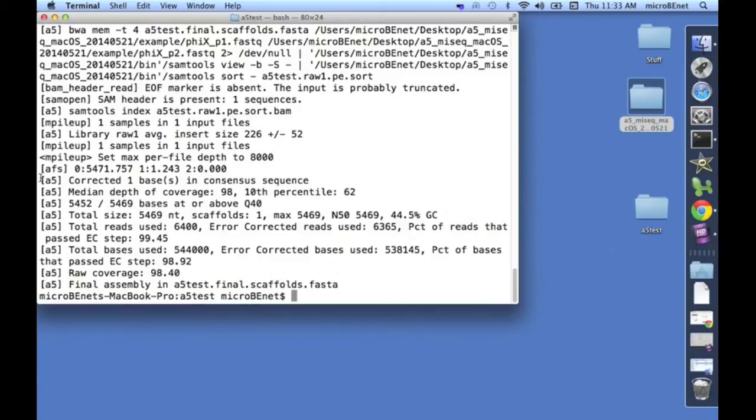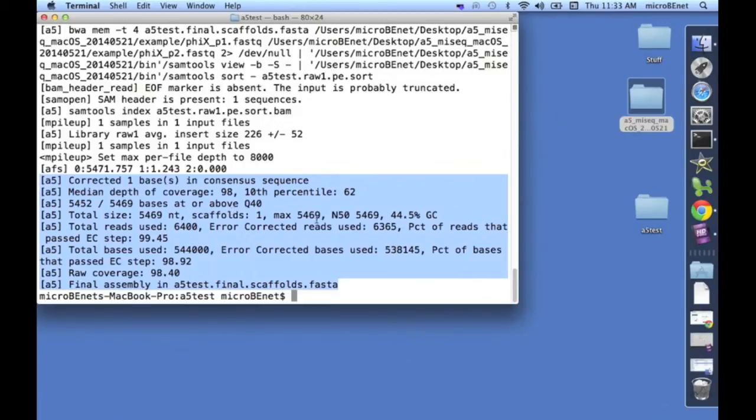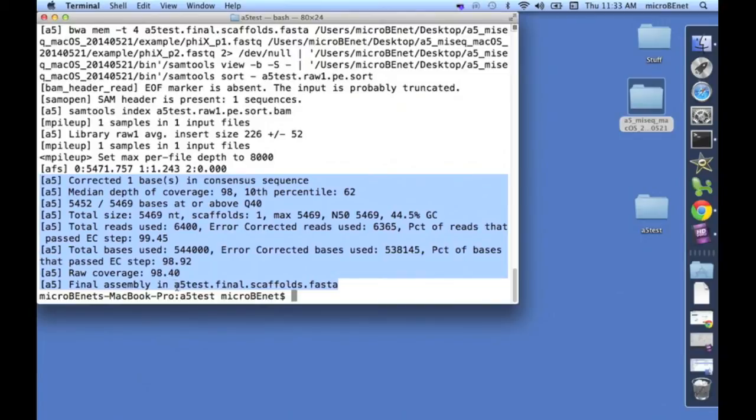Here, at the end, is displayed a variety of useful information about the assembly. The depth of coverage, the number of bases, the number of scaffolds, the N50, the GC content, the percentage of reads that passed error correction, etc. It also tells you the final assembly is in this file. A5-Test-Final-Scaffolds.fasta.